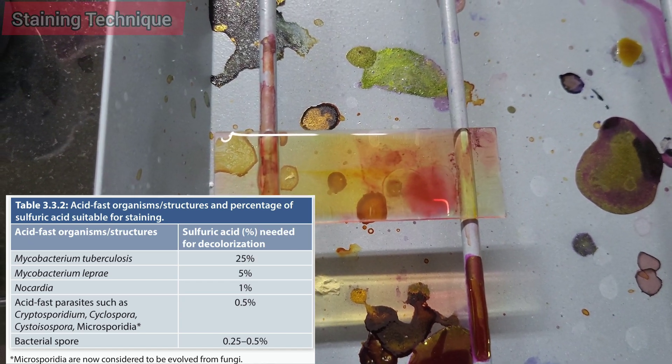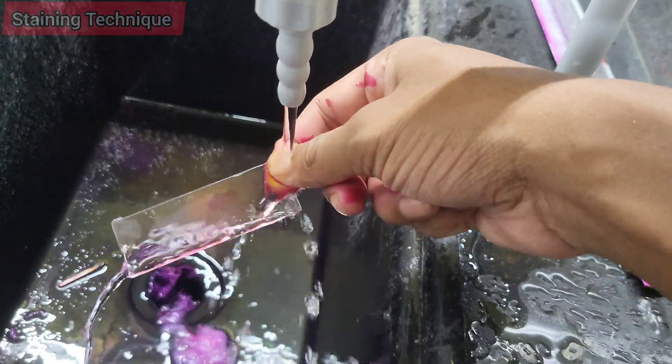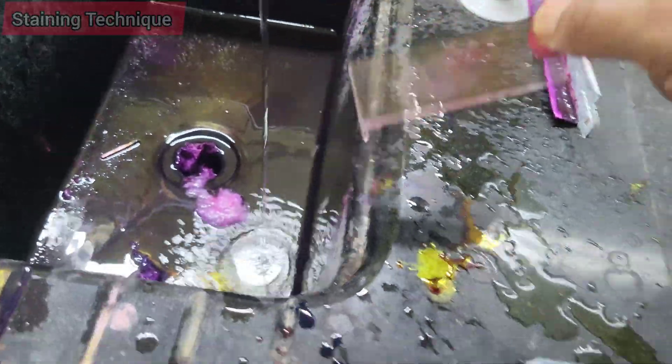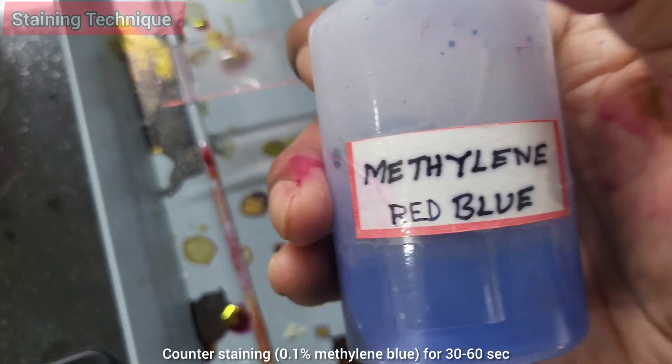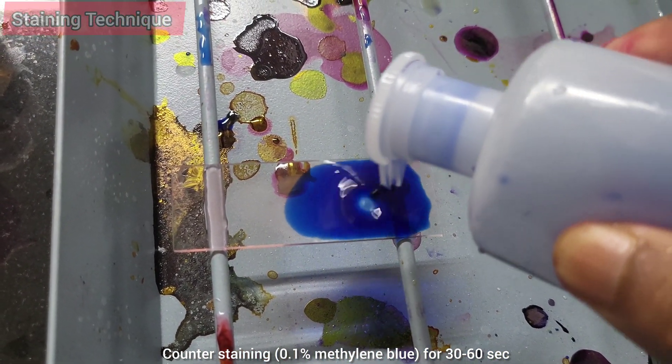Step three: counter staining with the help of methylene blue or malachite green. 0.1% methylene blue is poured onto the slide and left for 30 to 60 seconds. Why counter stain is used? To provide contrast by staining non-acid-fast organisms and background. Why Ziehl staining is important in TB diagnosis? It provides early evidence of Mycobacterium tuberculosis infection.